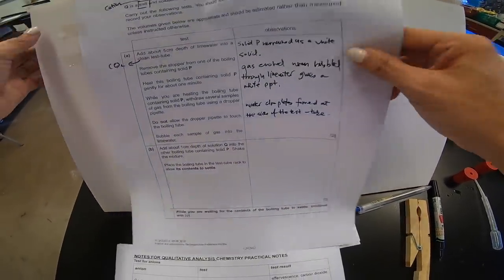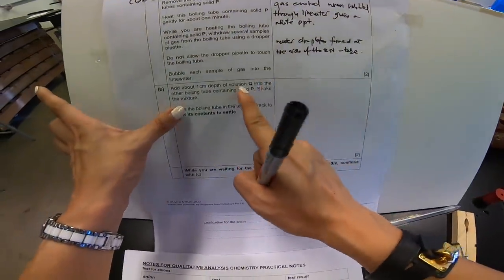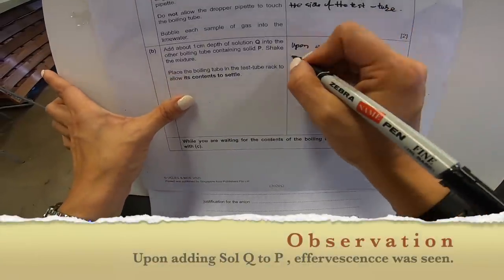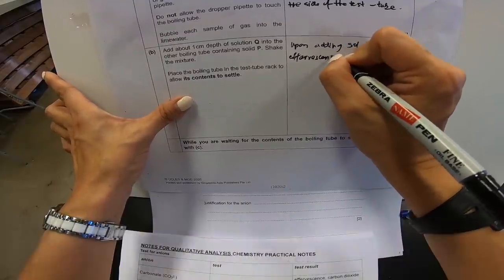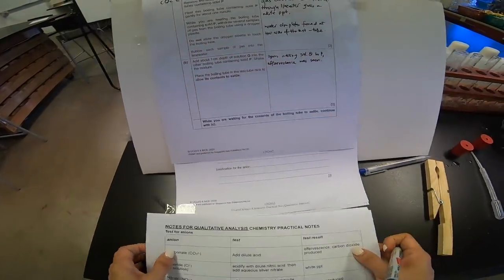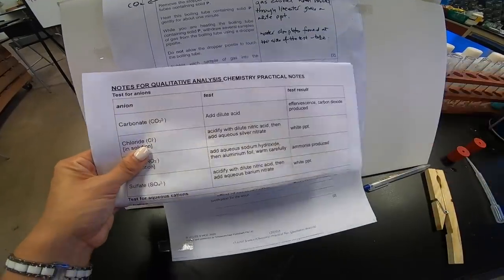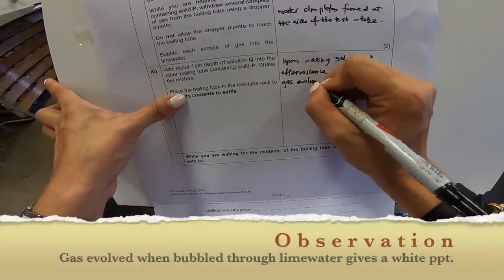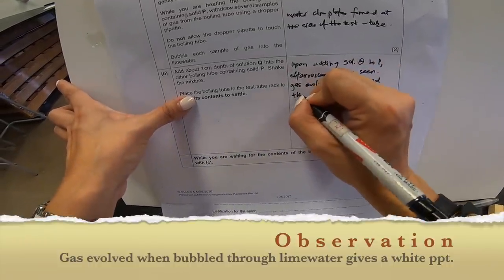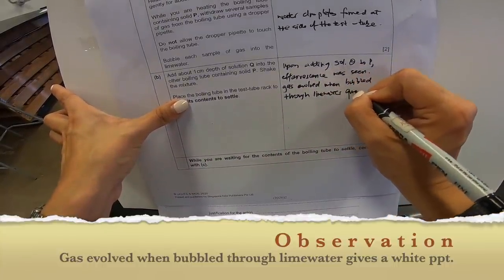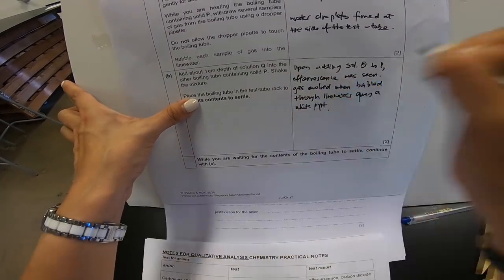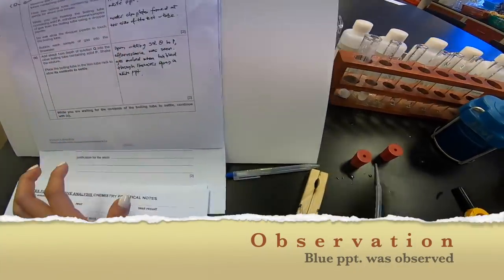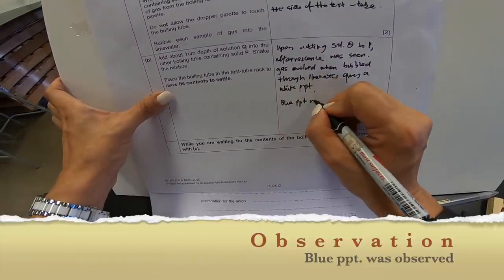Well, I don't get a white precipitate. But, like I always say, if there's effervescent, there is existence of gas. So, what I'm going to do is I'm still going to take a risk and write down suspecting that it is actually carbon dioxide. So, let me shift the paper up. I'm going to write down the observation. So, just now when I add whereupon adding solution Q to P. Effervescent, E-F-F-E-R-V-E-S-C-E-N-C-E. Effervescent was seen. Gas evolved when bubble through lime water gives a white PPT. Secondly, it's quite obvious over here that upon adding solution Q into solid P, a blue precipitate is formed. So, I'm going to say a blue PPT was observed.